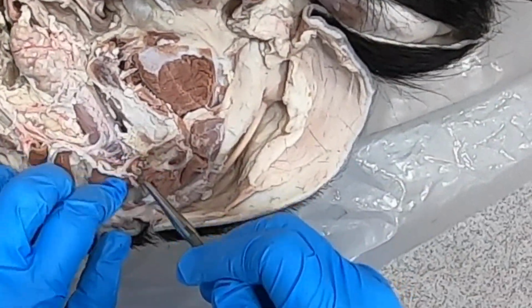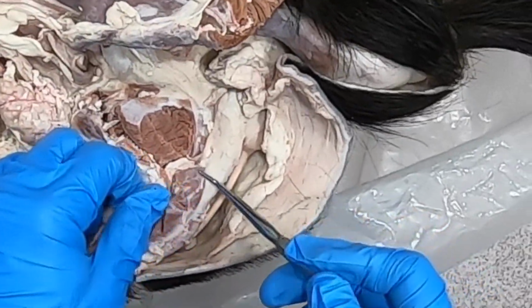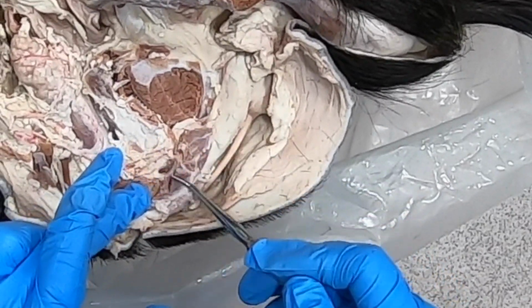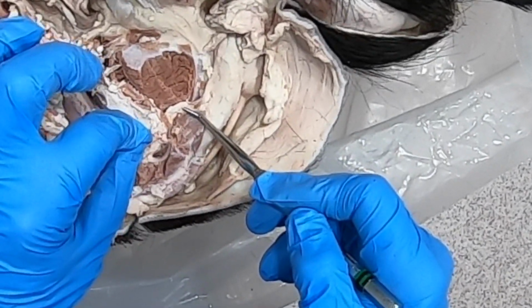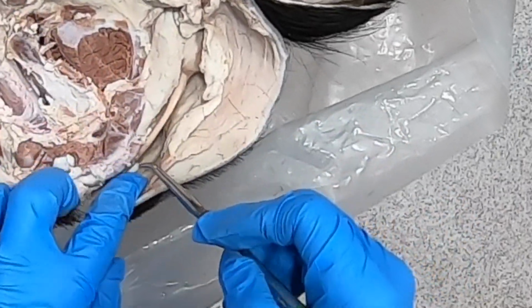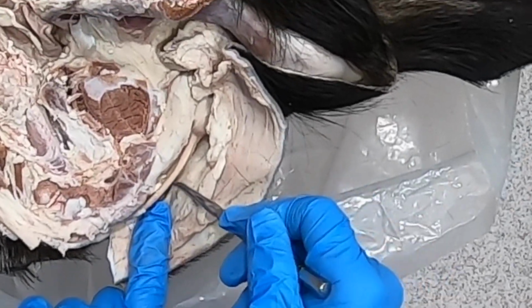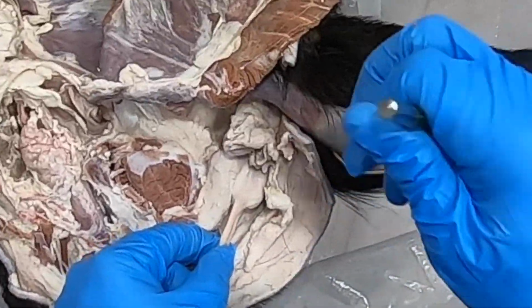And then we go into our penis here. Once again, this muscle that was surrounding the crus, and the first part of the penis here is the Ischiocavernosus. It attaches to the ischium on the ischial tuberosity and comes around to attach here. Then we have this muscle here, which is the bulbospongiosus muscle. Then we have our two retractor penis muscles.